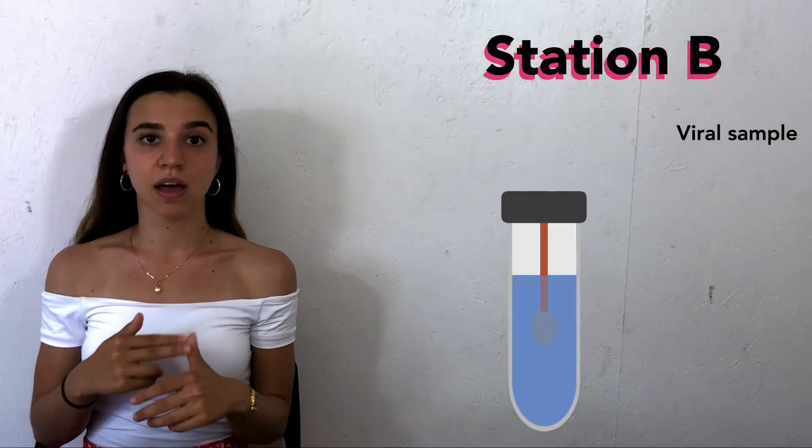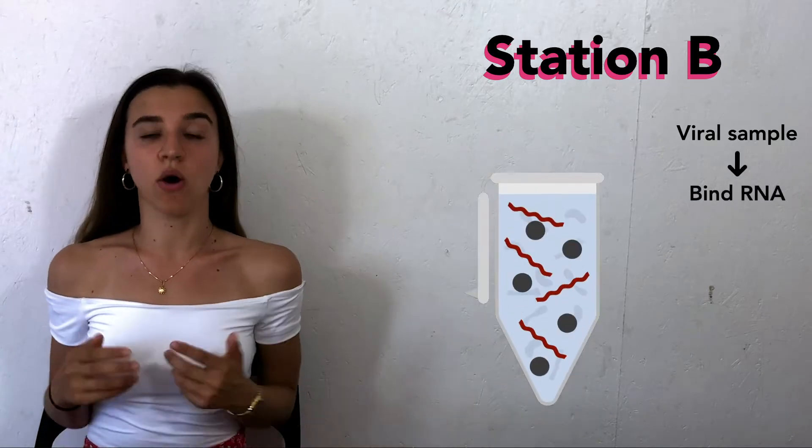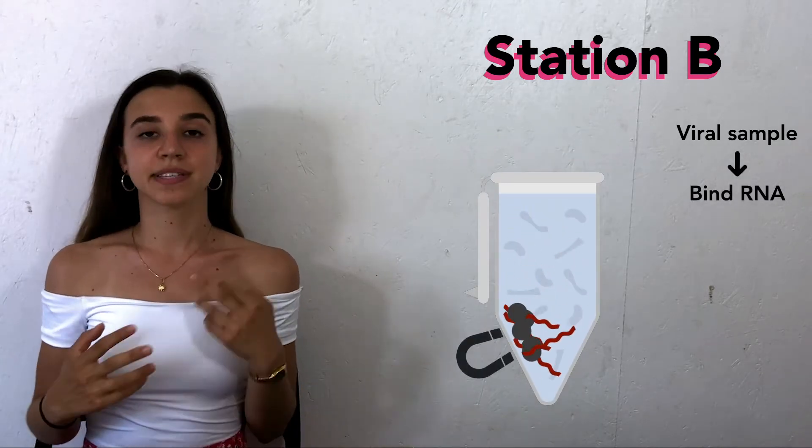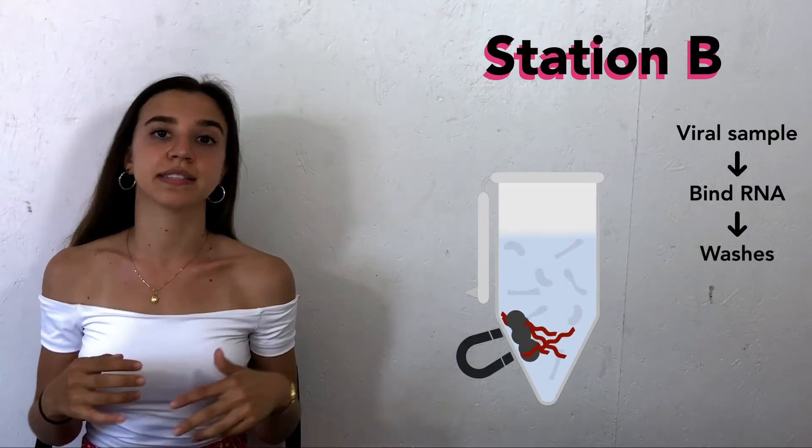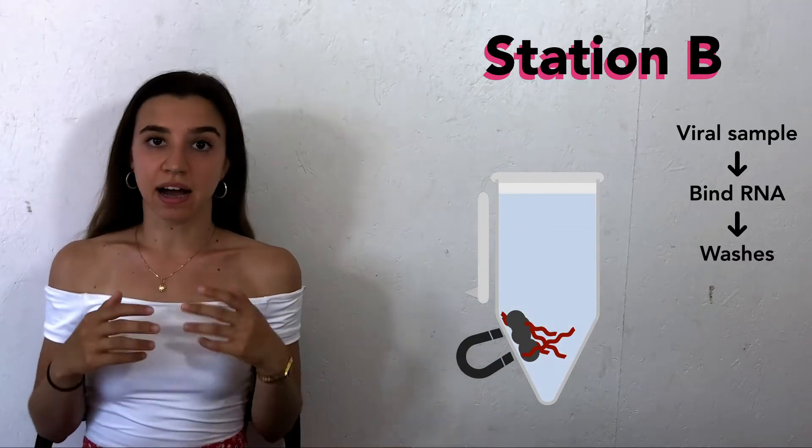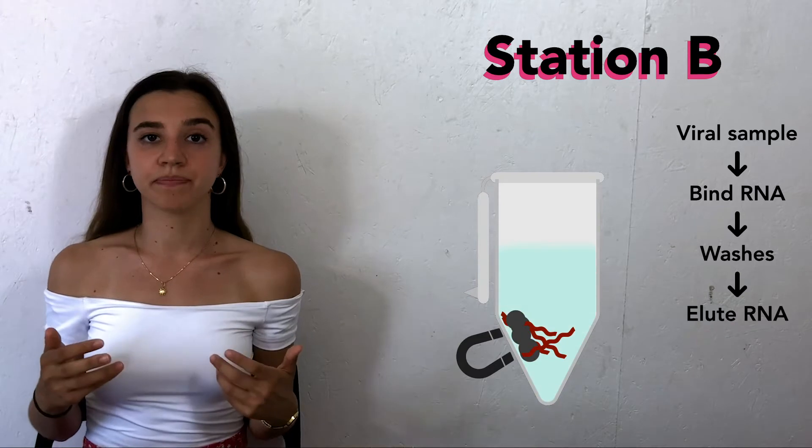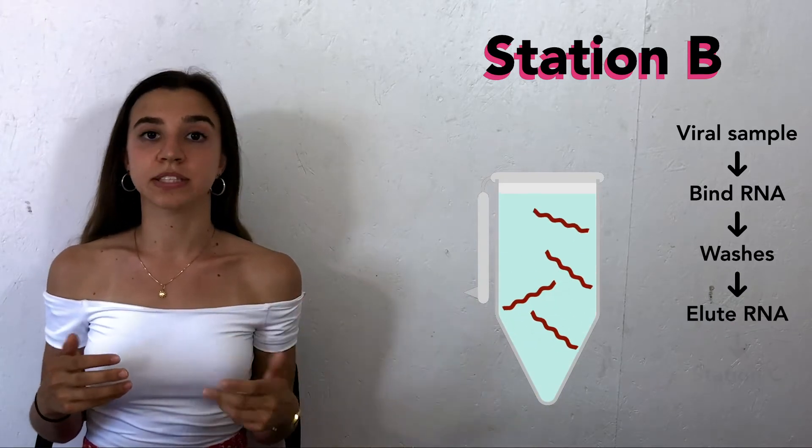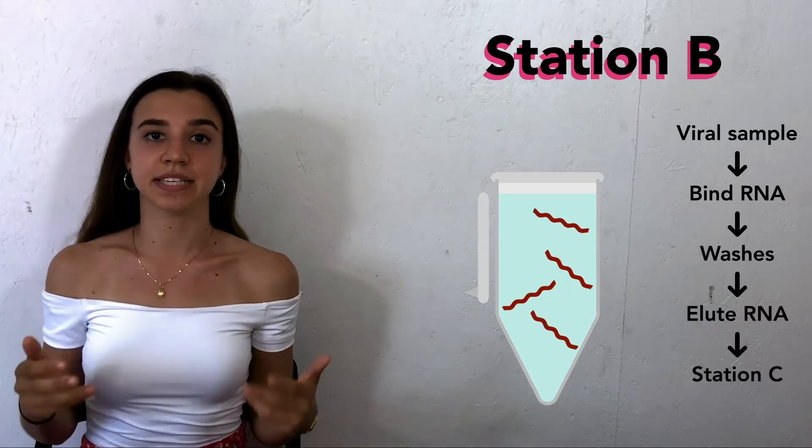The Station B protocol broadly aims to take a viral sample, bind the sample RNA onto magnetic beads, and use a series of washes to remove any cellular debris or contaminants. After this, the isolated RNA will be eluted, ready for reverse transcriptase qPCR in Station C.